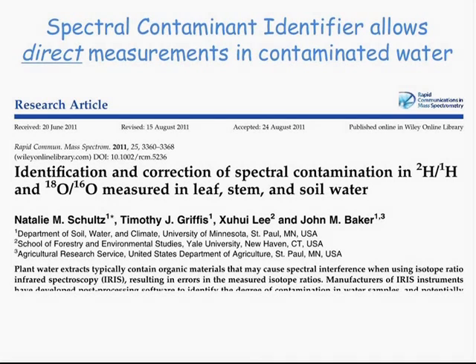Got a break? All right, there appears to be a question from Kathy Tate asking about the precision of 17-excess for natural samples. We expect that the precision on the 17-excess for natural samples is the same as those for the standards that we have tested. We have several groups that have been using the instrument, and we haven't heard anything differently from that. So I am very confident in the instrument. I have done my own research as well on this, and while it's not published, at least that I haven't published it, the available precision is the same for all of the clean water samples.